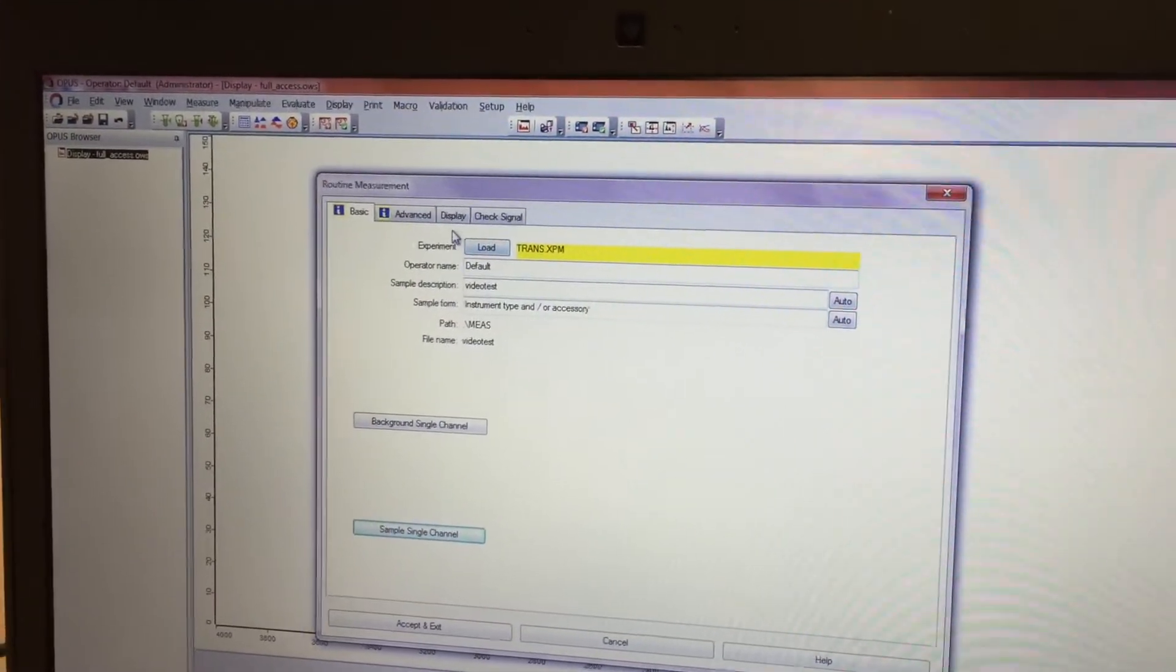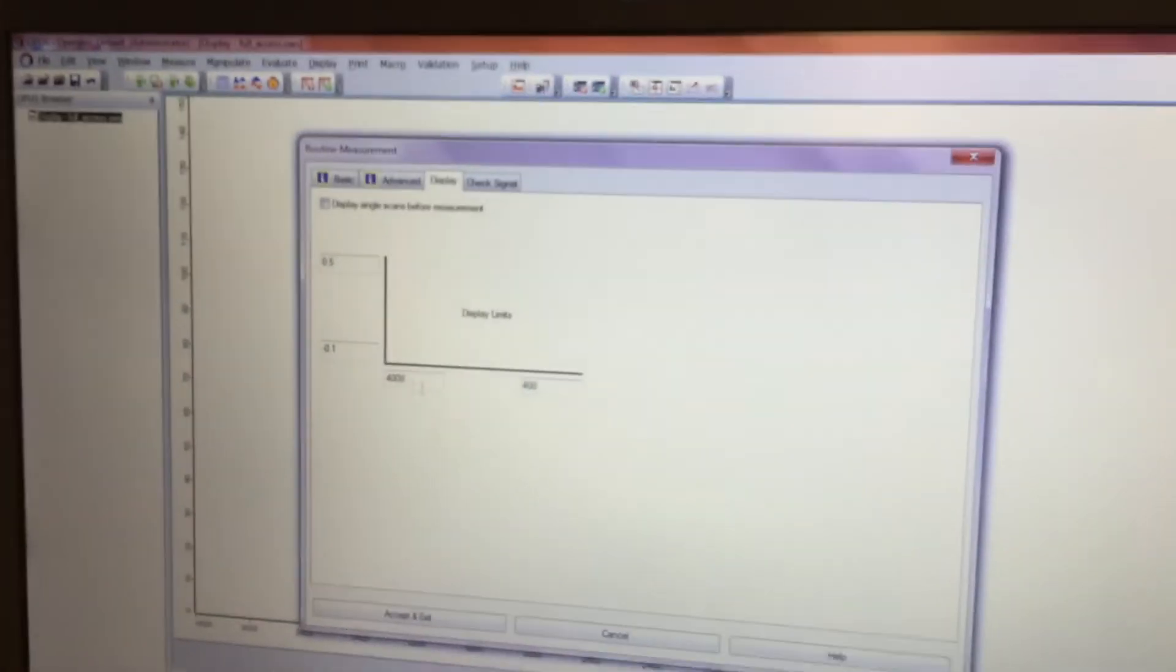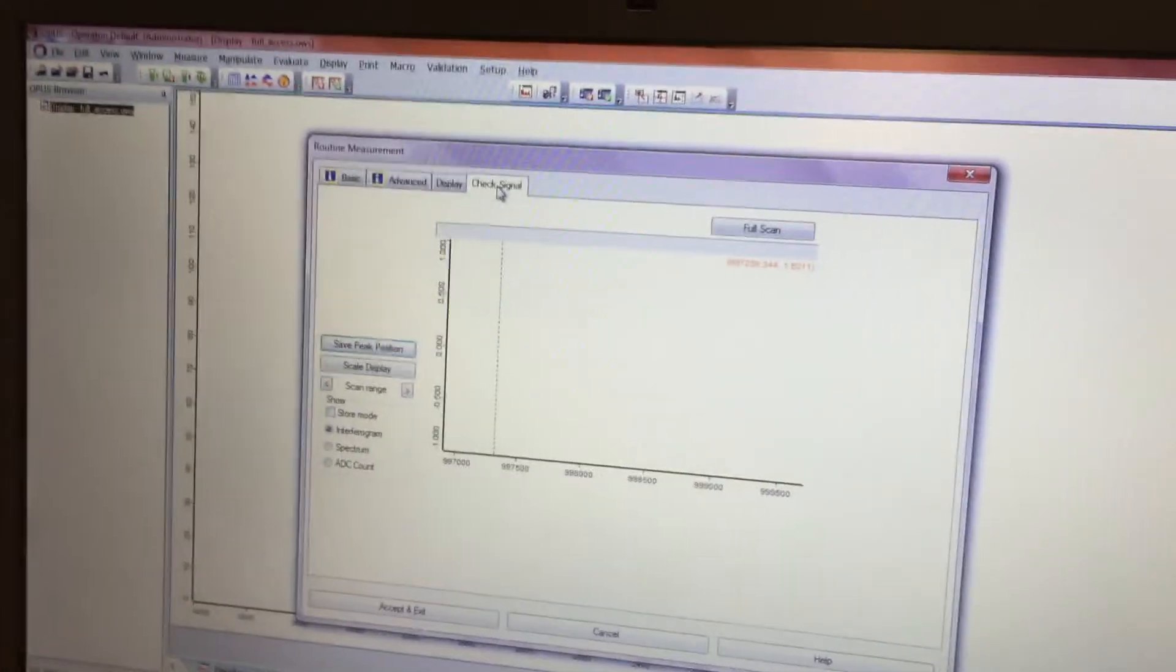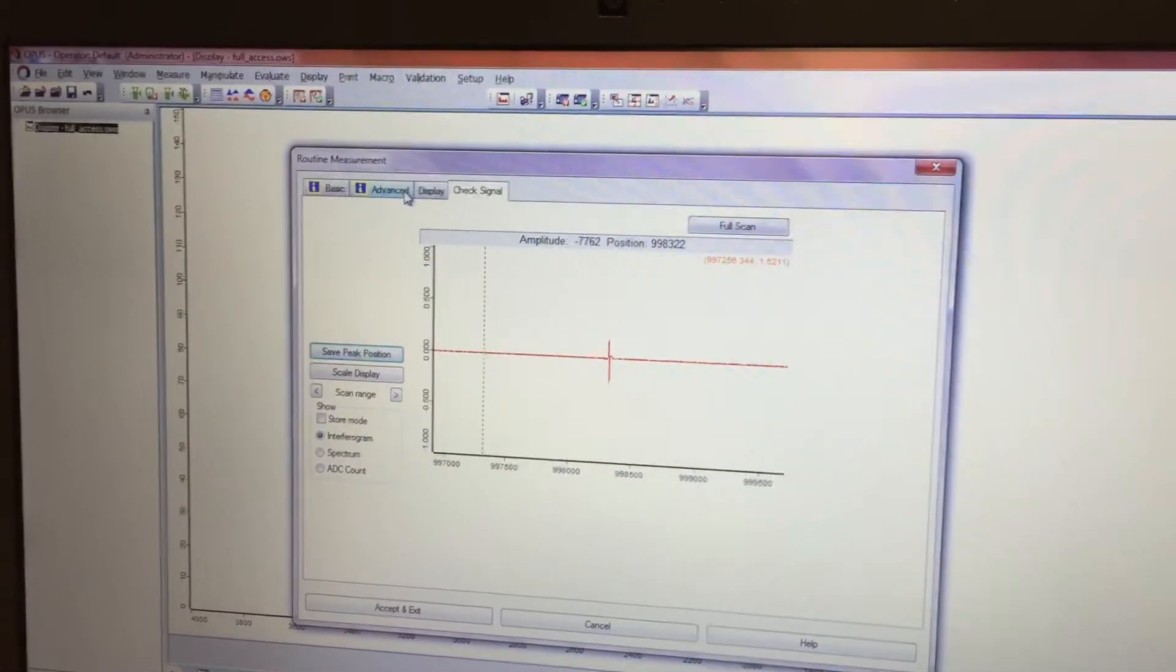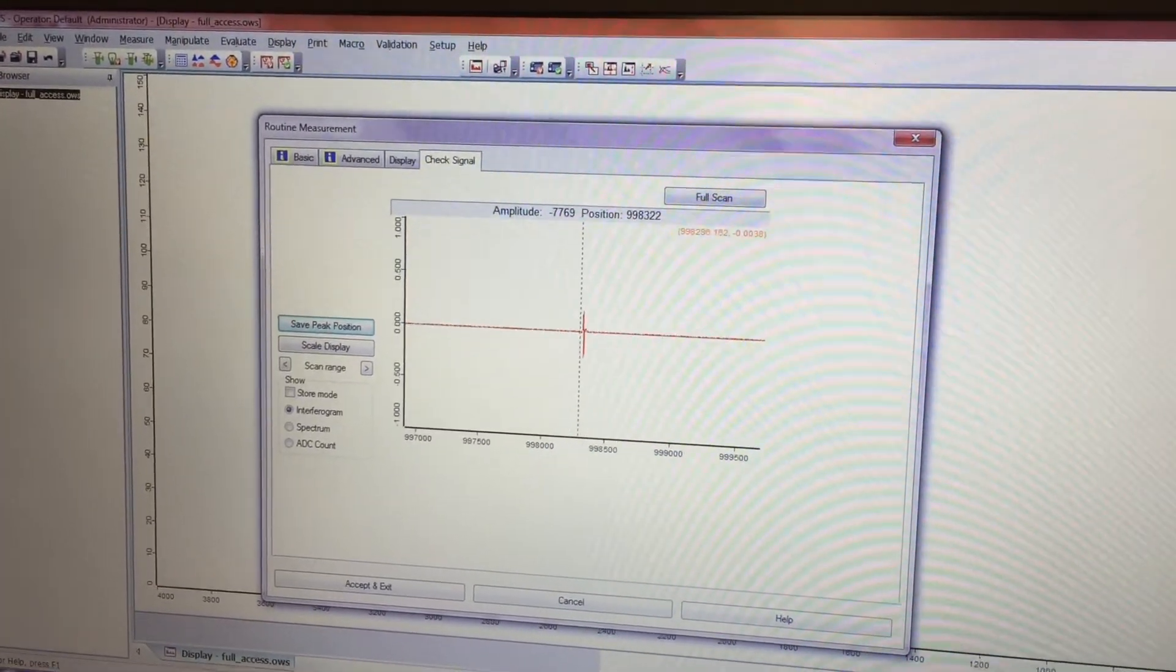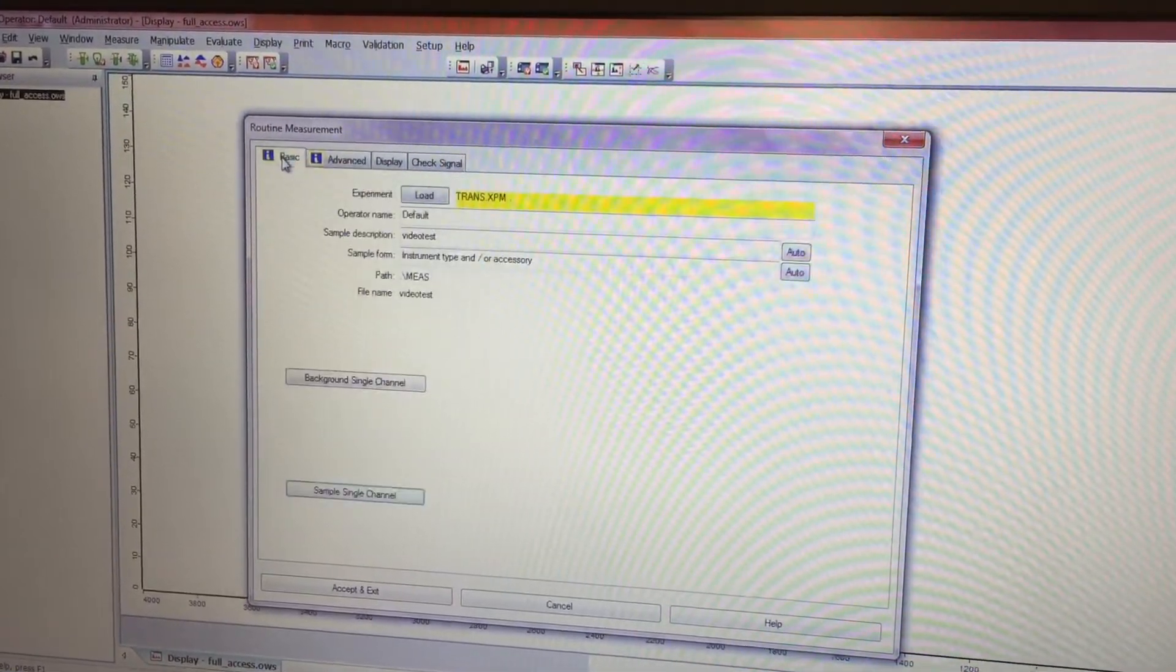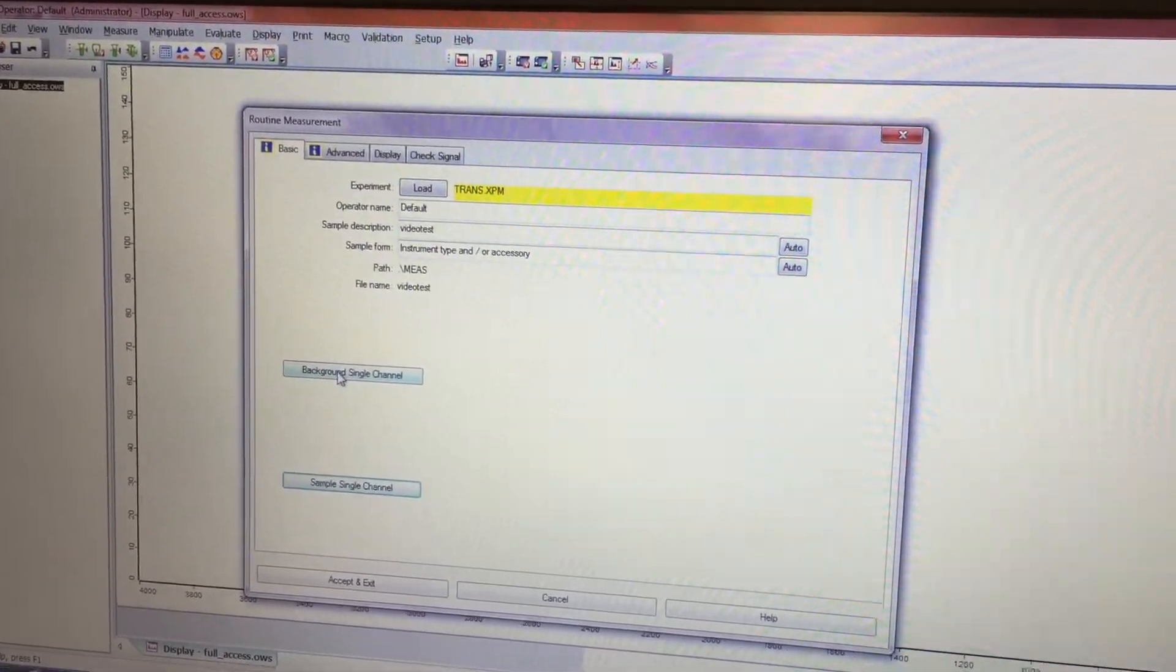Basic, you can do the same. Display, you can set the display limits. Right now it's 400 to 4,000, so we'll leave that. Check signal, I'm not going to do that. You can see the peak position of the interferogram. That should be fine.